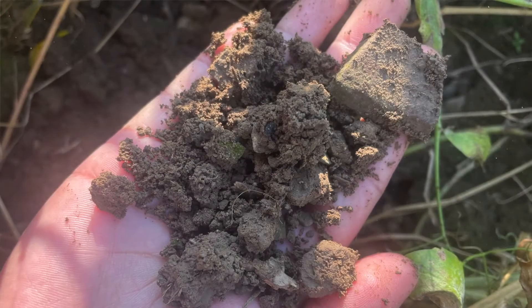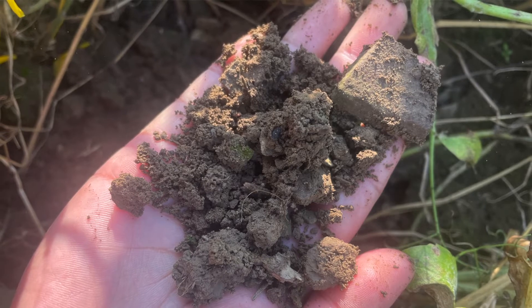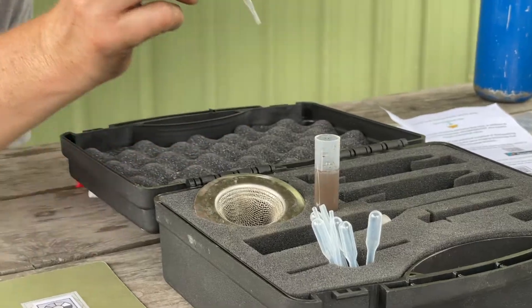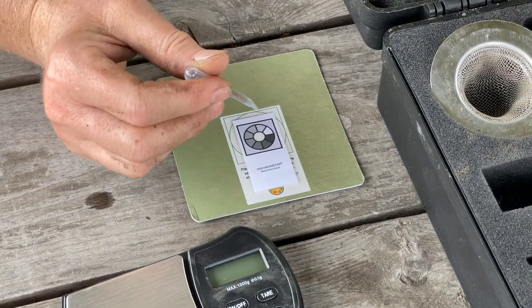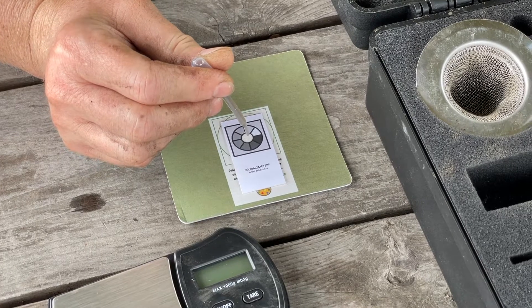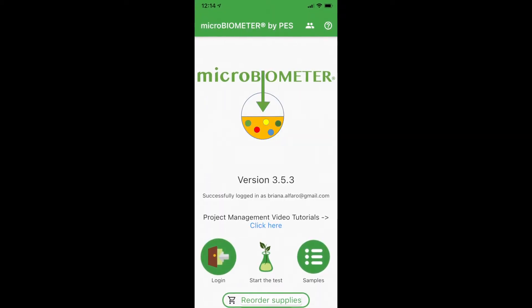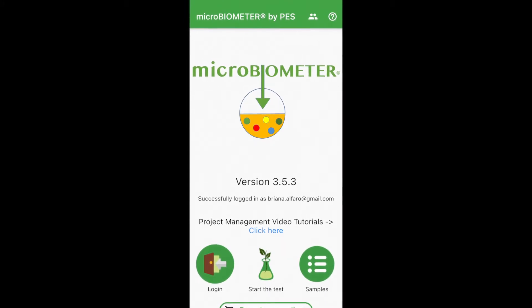Soil microbes release sticky compounds that help bind soil particles together into bigger soil clumps, also known as aggregates. The microbiometer kit contains a solution that releases the microbes from the soil particles. After the microbes are separated from the soil, their biomass can be measured. The microbiometer system utilizes a mobile app to read the color contrast of the microbes against a special test card and provides the resulting microbial biomass. The mobile app also provides step-by-step instructions, which is very handy. However, I found that the timer within the app did not function correctly on my phone, so I recommend using the timer on your phone or another timekeeping device. Keep in mind that the microbiometer instruction manual notes that biochar applied within six months before testing may affect results.